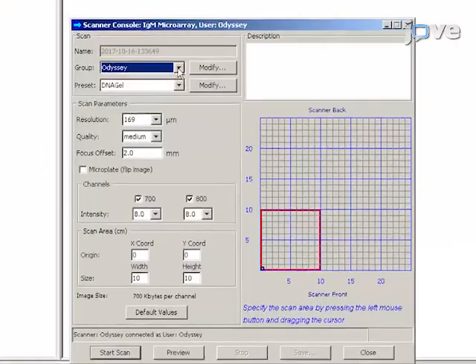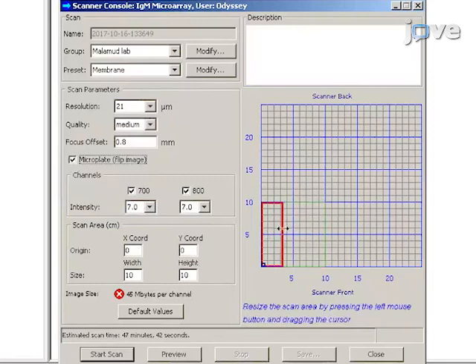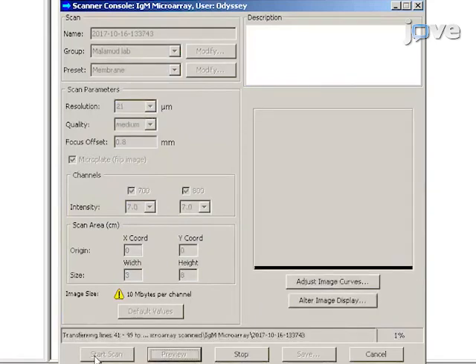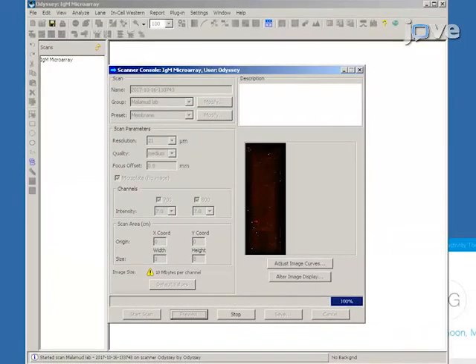Set scanner parameters with a resolution of 21 microns, an intensity of 7.0 for both the 700 and 800 nanometer channels, a scanning quality of medium and an offset of 0.8. Acquire and save the scanned raw image as a 16-bit grayscale TIFF file format.